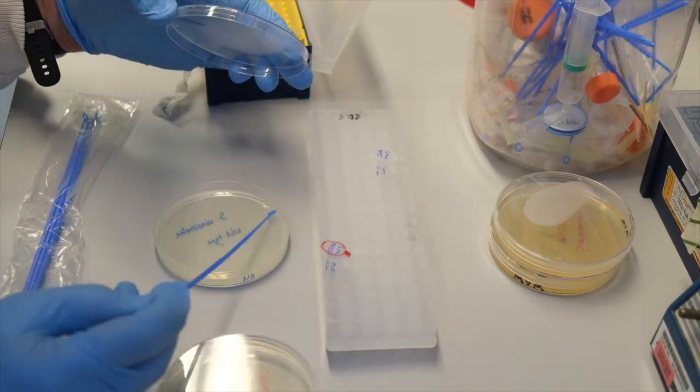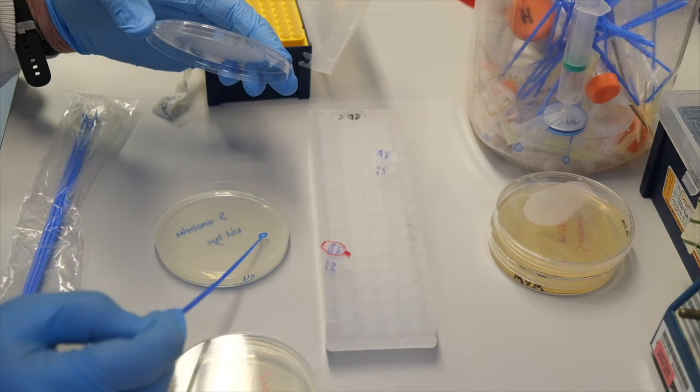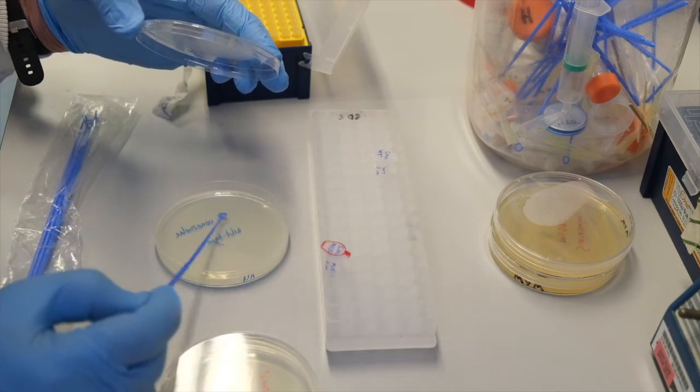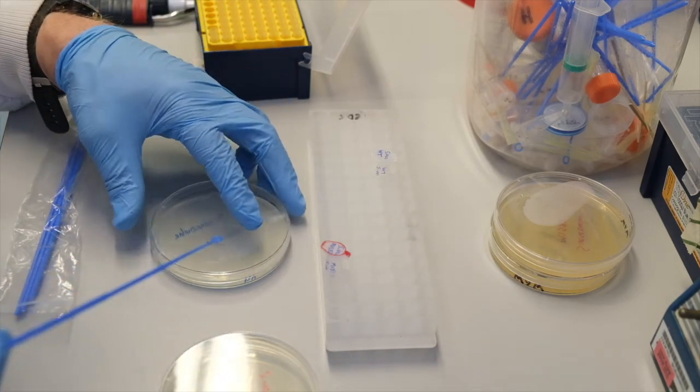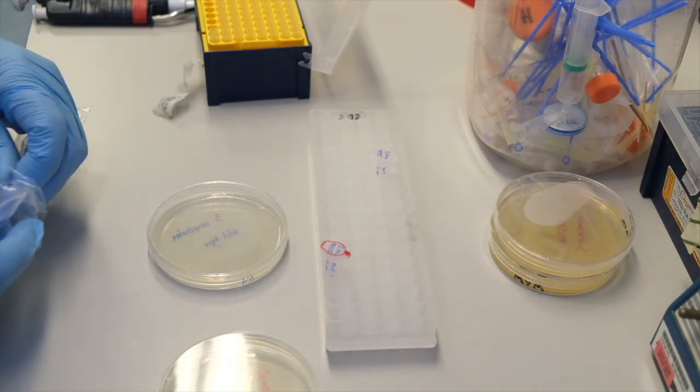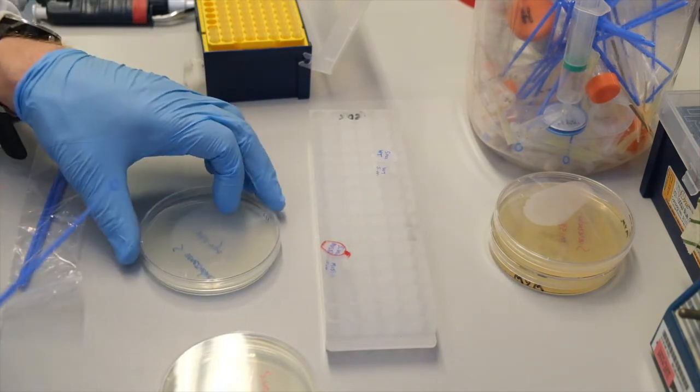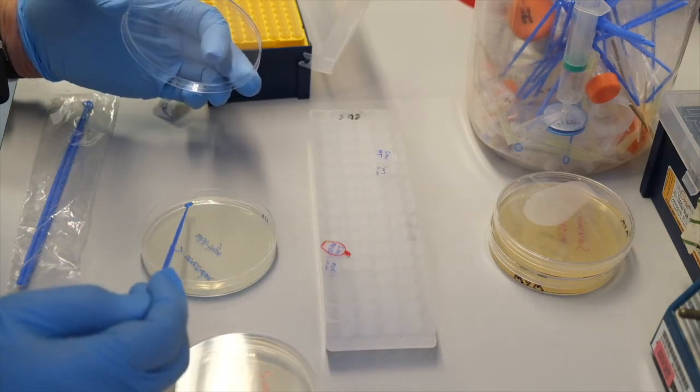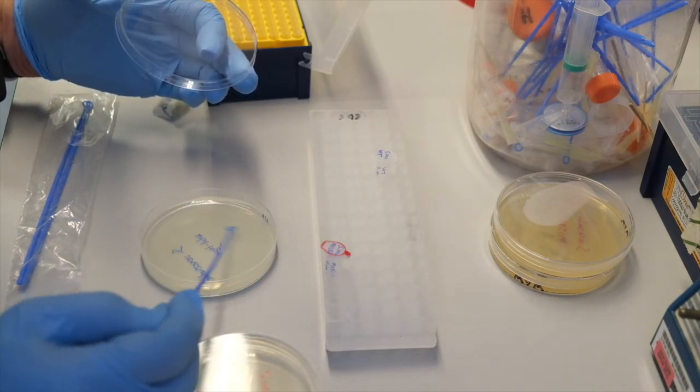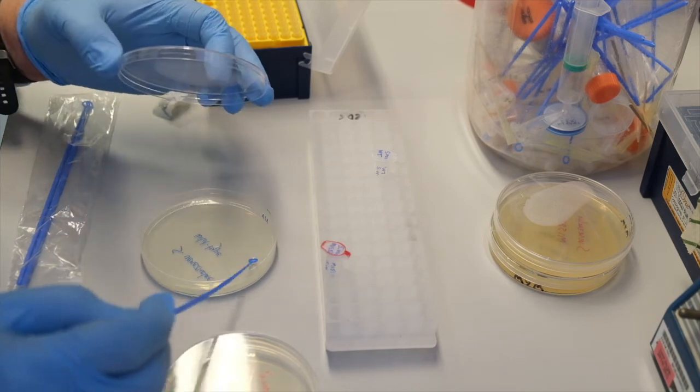Rotate the plate and do the second set of streaks, crossing the first streaks. Finally, fill in the rest of the plate using the third sterile loop.